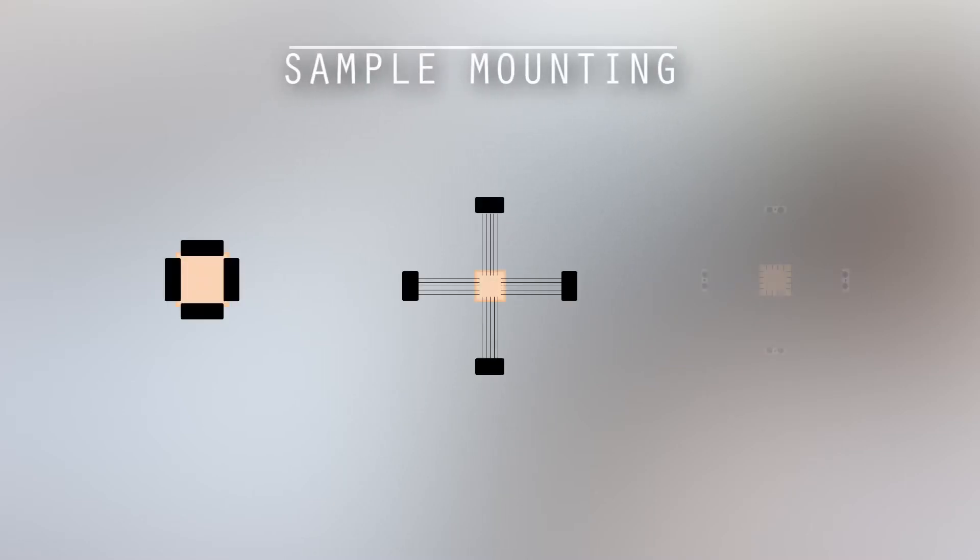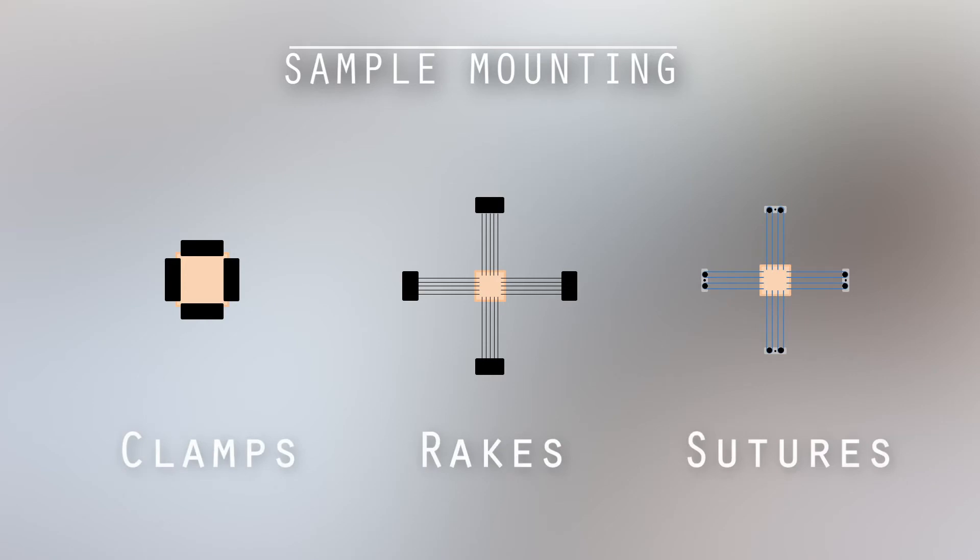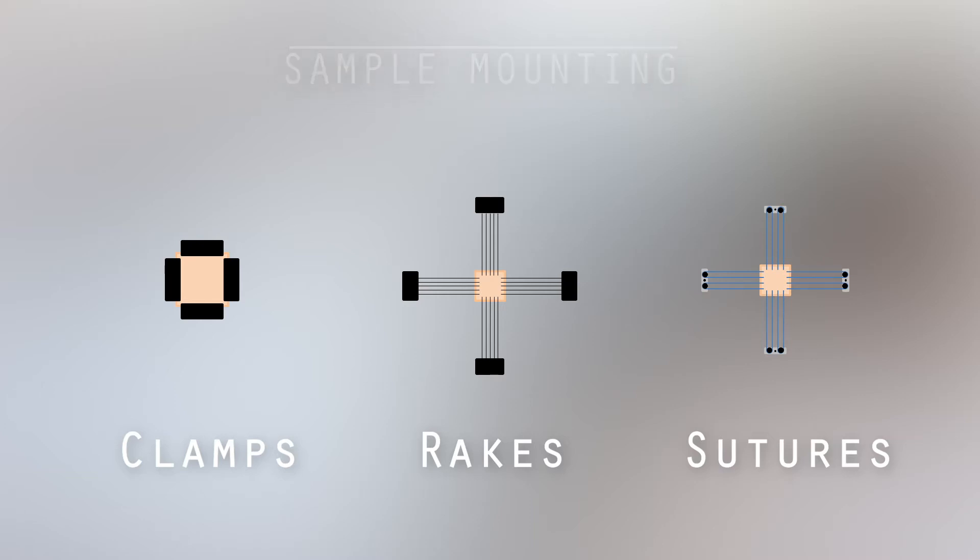To attach the sample to the testing device, different mounting mechanisms such as clamps, sutures, or rakes can be used. These all affect the boundary conditions of the test differently, and this must be taken into account when processing the data.